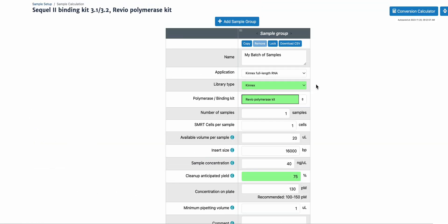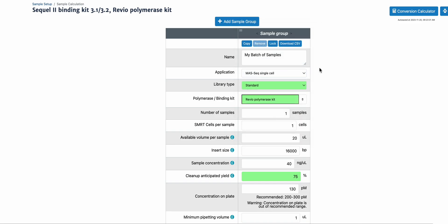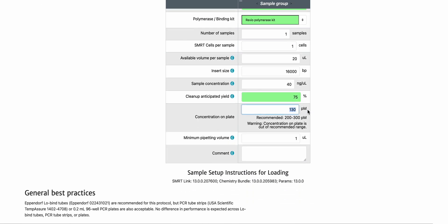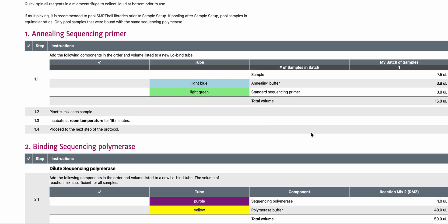Note that if you are using the MaSeq for 10X single-cell 3' kit, in application you should be selecting the MaSeq single-cell, which has a standard library type, a different concentration recommendation, and uses the standard sequencing primer.